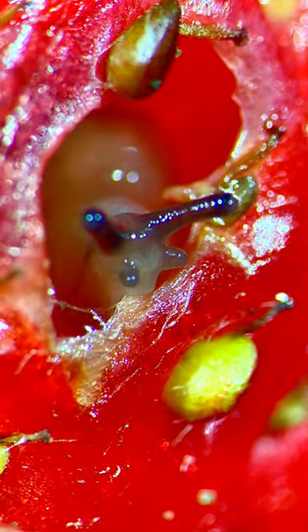And under polarized light, these just look incredible. Using this technique, I was able to find that different parts of the strawberry could bend the light and change color in different ways. So that was pretty cool, but I think this is my favorite find.